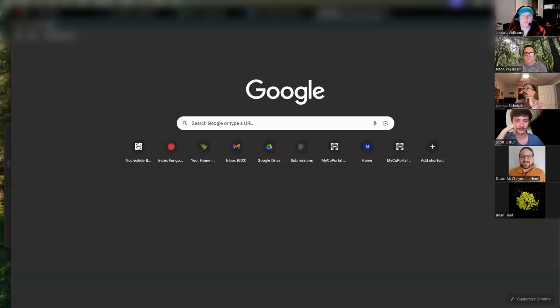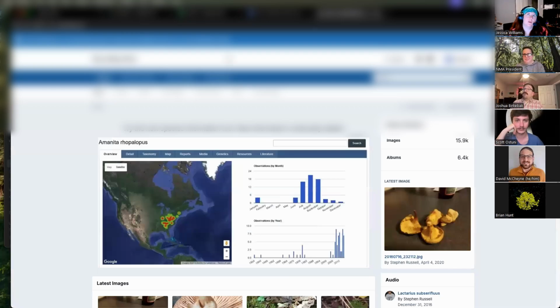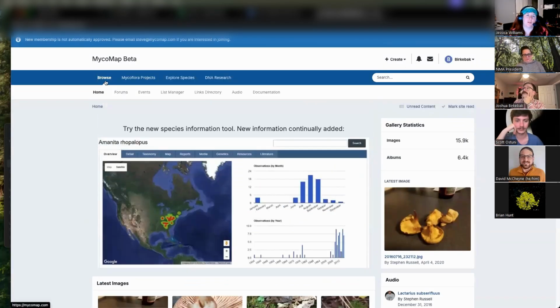I mean, you could probably code a bunch of Excel prompts to search for the voucher number in each column. But then the formatting's different: some have spaces, some have dashes, some have underlines, some have colons. That's what makes it so there's no perfect way to automate that, but there's probably a way to clean it up a lot so that you're doing a lot less manual work. You're still having to do some.